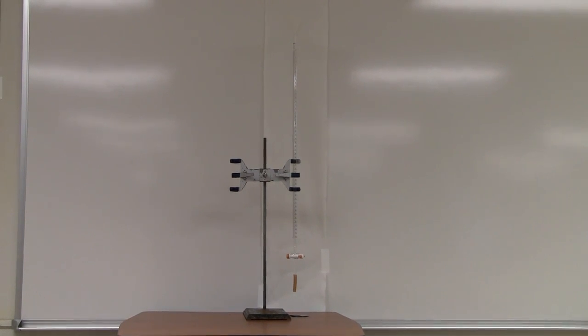Like a graduated pipette, a burette is used to add a precise volume of liquid to a receiving container. Volumes are read to the hundredths place. The markings are similar to those on a graduated pipette, with zero at the top and increasing numbers down the length.